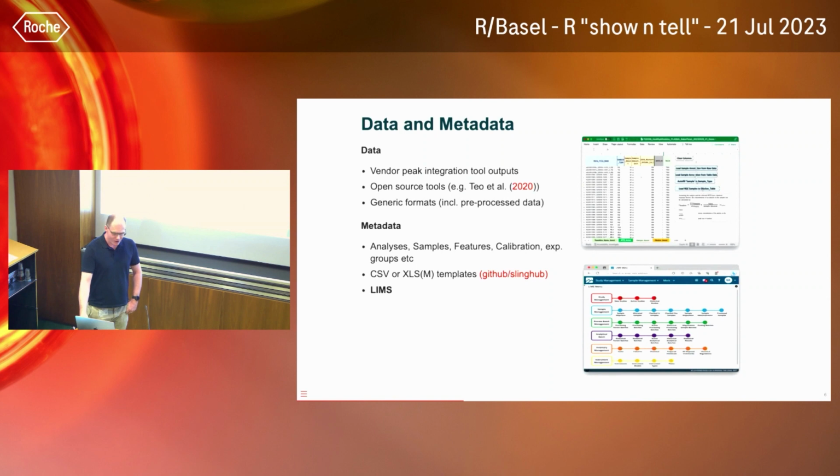And so this metadata exists in lab notebooks, in Excel sheets, in emails. For data analysts, it takes many emails and many communications to really collect all the metadata, complete, valid, and with correct integrity. And often there are further steps. We realize that some of the metadata doesn't fit, or there are too many samples, or some features don't have matching metadata, and so on.